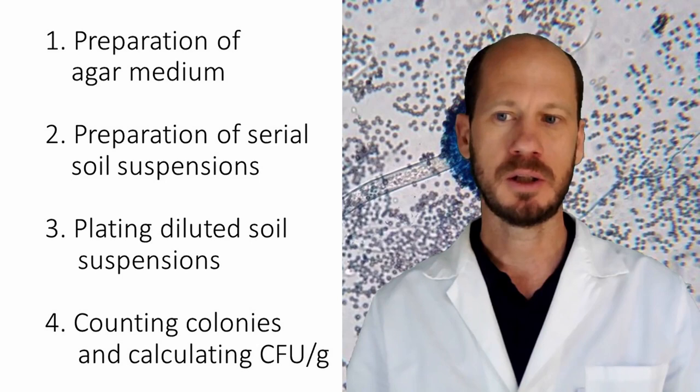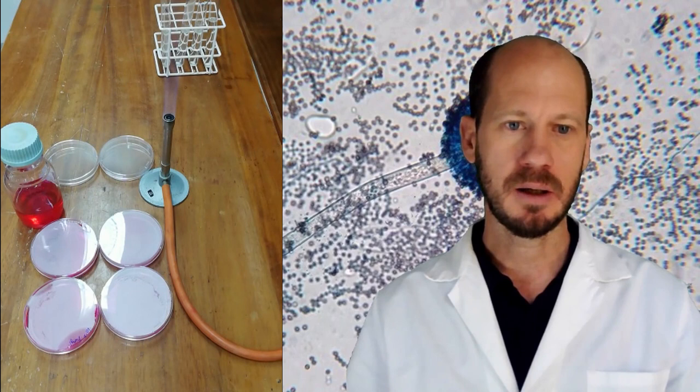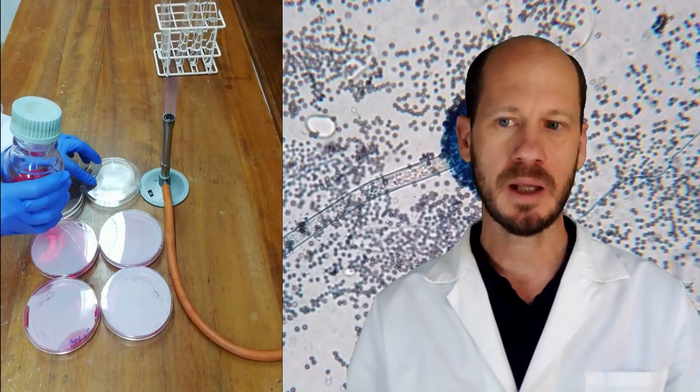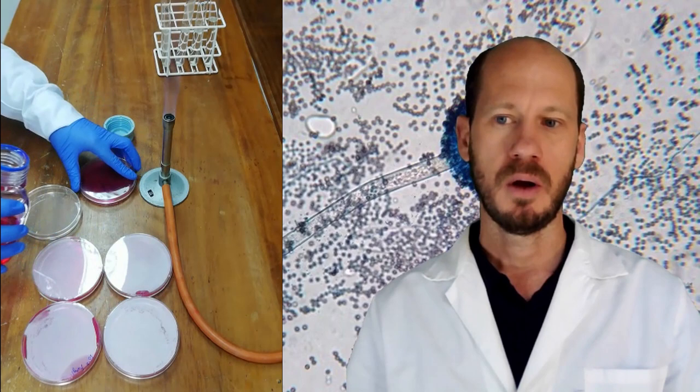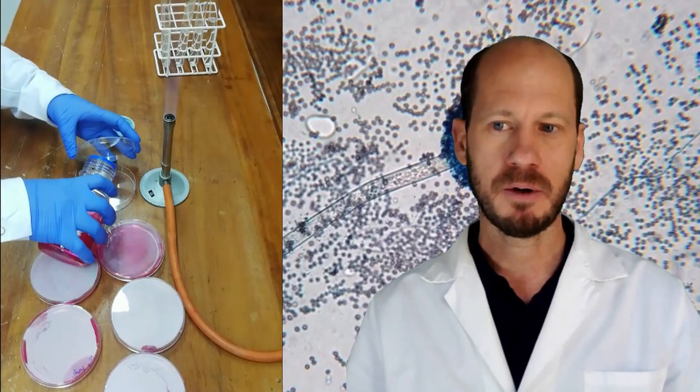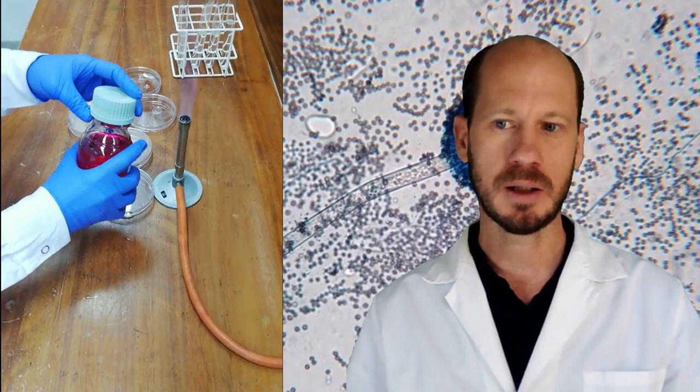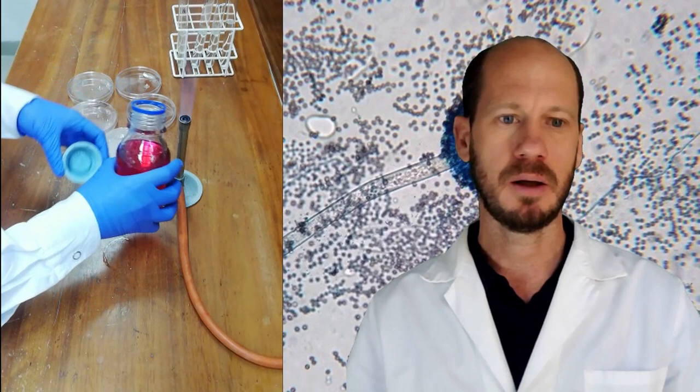Here on my right you will see the plates that have been prepared. We have three types of medium. We have glycerol casein agar for actinomycetes — actinomycetes are a group of gram-positive bacteria — and we have a general medium for bacteria which is tryptone yeast extract agar, and the medium for fungi will be rose bengal agar. This is the preparation of the medium.